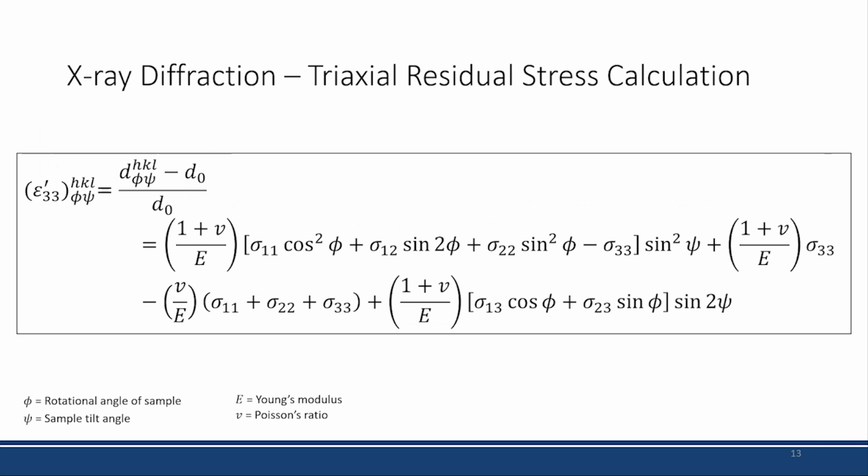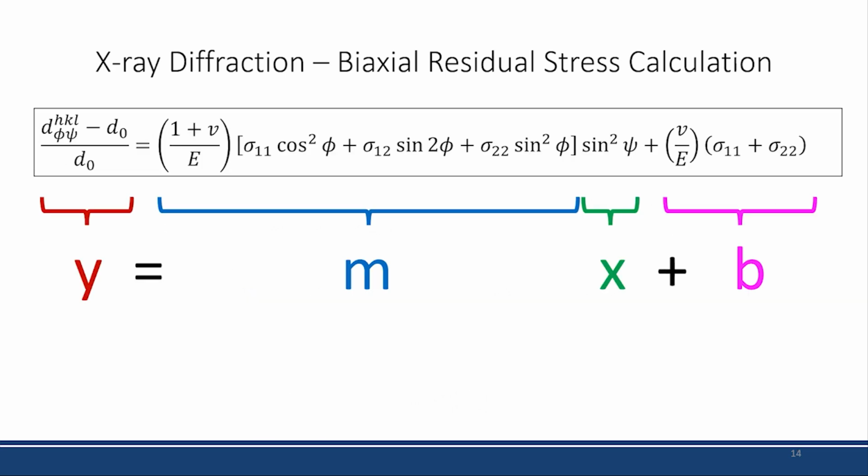For thin film materials, because the direction out of the plane is so small, we're typically going to refer to these as biaxial stress states, which means that these reduce down to just being 3 directions, one in the 1 direction and 2 direction and 1 2 direction. That would be in the plane of the actual film.